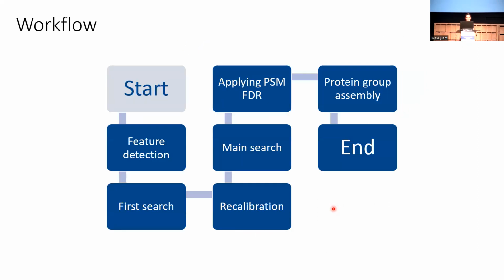Now we talked about a lot of things, so let's go step by step. When you press start in MaxQuant, there are some very important steps that we go through. Hopefully all the pieces that we talked about will now make sense and we will put them together. These are only some of the steps, not all of them, but they are the most important ones for you to understand.